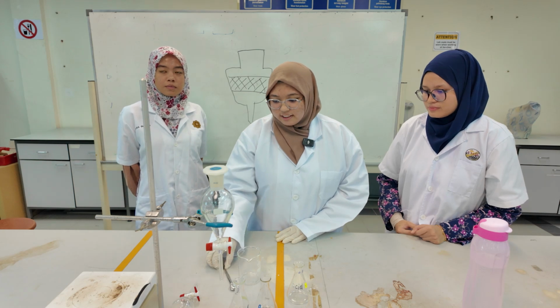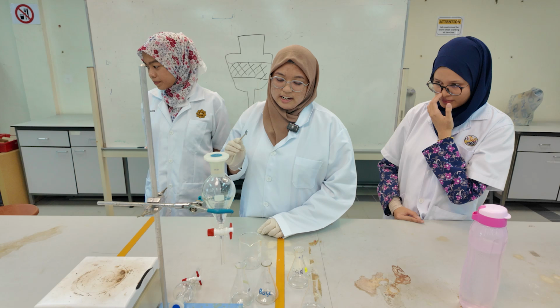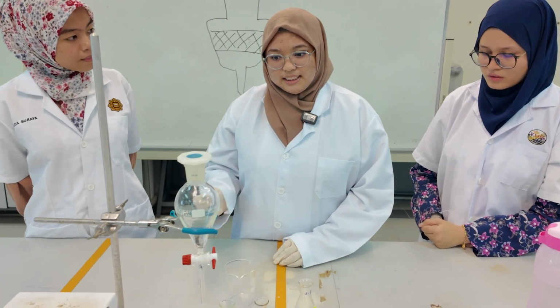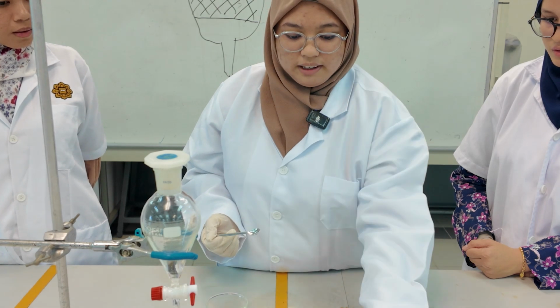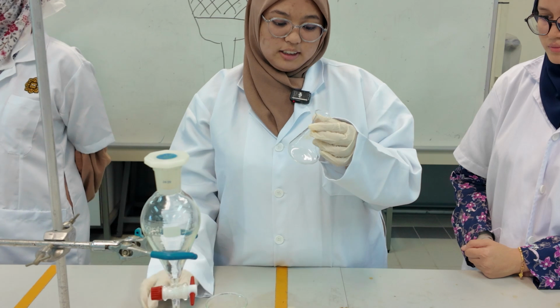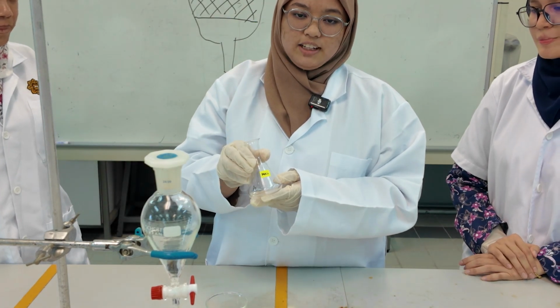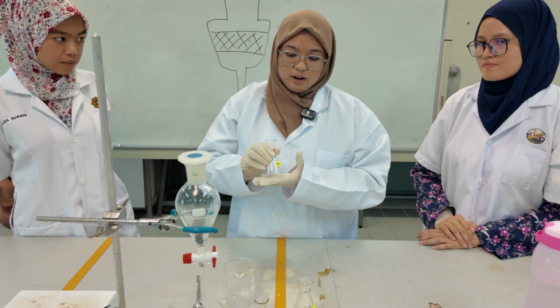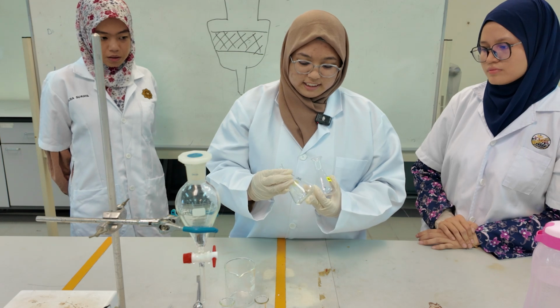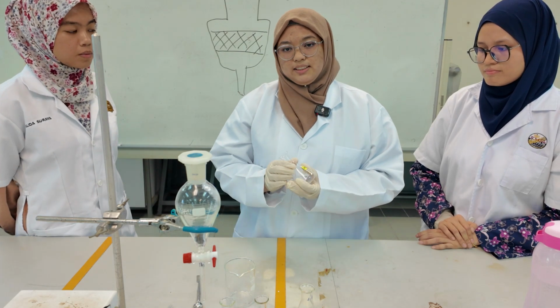The first thing is we will be using a spatula to weigh the acid, base and neutral compounds separately before mixing them all into one flask. This flask is the mixing flask, which has all 3 compounds inside it. Make sure to label every single flask to avoid any confusion and avoid any mixing.